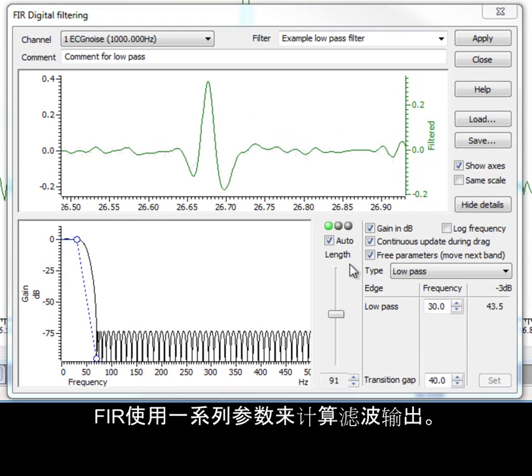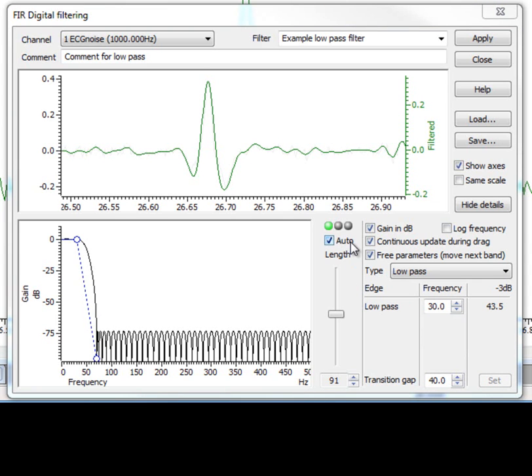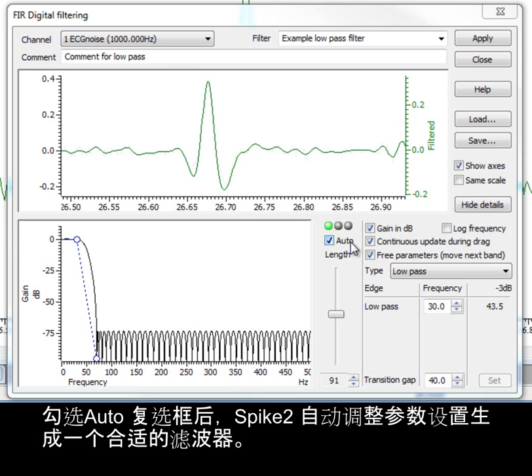FIR filters use a set of coefficients to calculate the filtered output. With the AUTO checkbox enabled, Spike2 automatically adjusts the coefficient setting to produce a useful filter.